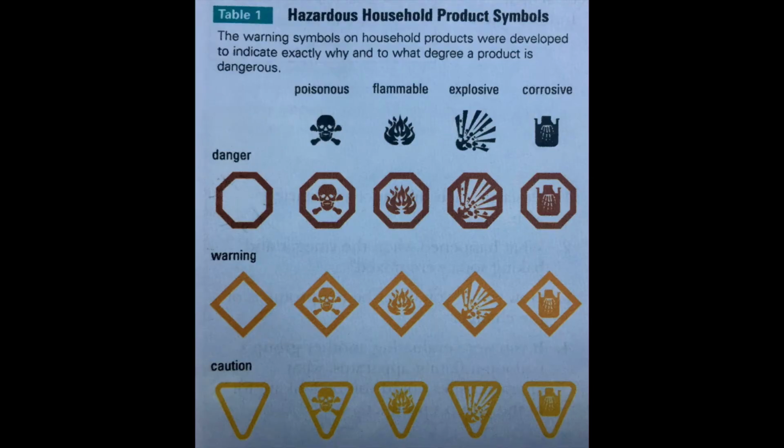Just a note. Not all of these symbols are universal. Most of them are. These are specific to Canada. But it is very important that you understand symbols where you are locally. A teacher is going to give safety instructions before every lab. It's not just once in the beginning of the year. Safety instructions are gone over for every single lab done in a laboratory.